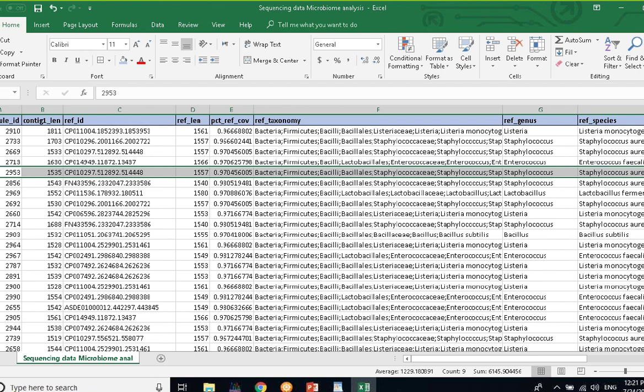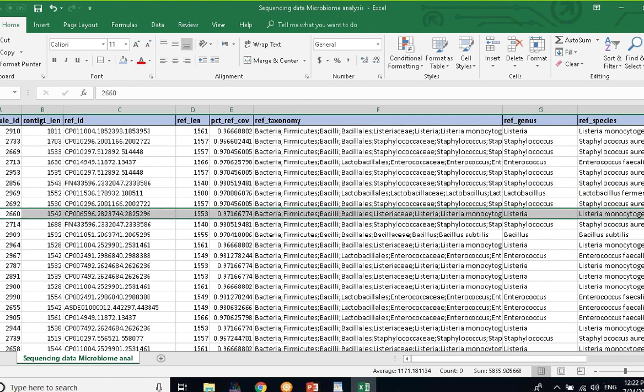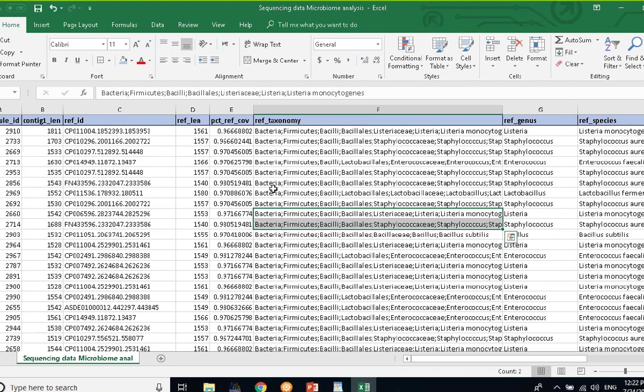Calculating relative abundance is trivial from these CSV files because, in contrast to regular Illumina sequencing, where a read just represents a read and not the actual abundance because it doesn't account for PCR biases, in this file each row actually represents not a read, but a single molecule, a barcode from your original sample. So calculating relative abundance of species from this file is actually very easy, just using simple, even Excel-based analysis. But we do go one step further and do these calculations for you. The output folder would include OTU tables and different pie chart visualizations of the classification and the quantification information.